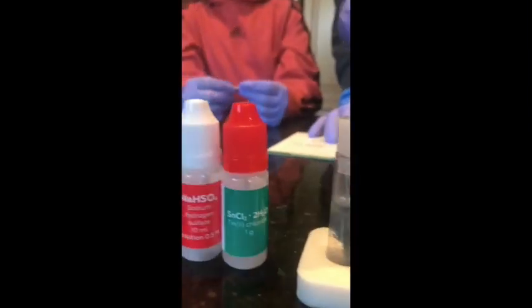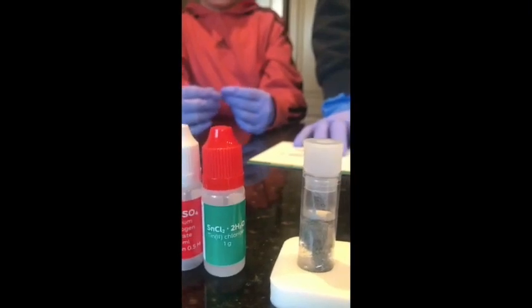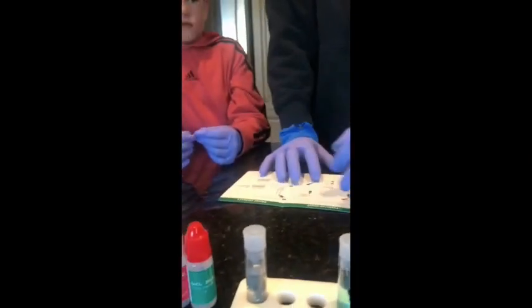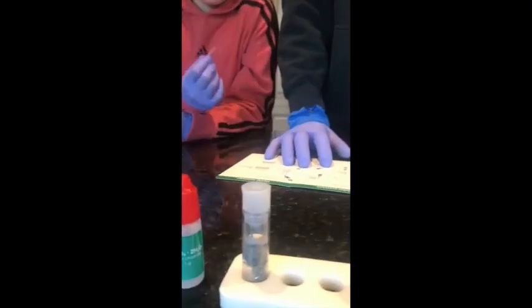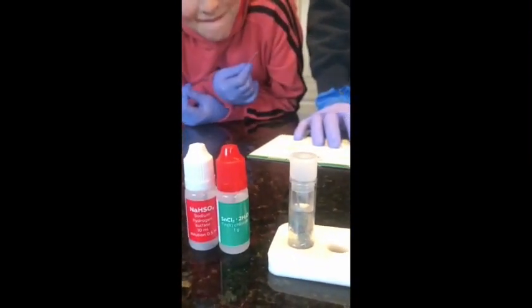And the second one we have, I just got to read them, I'm sorry, tin 2 chloride and sodium hydrogen sulfate mixed together, and we have a piece of magnesium in both containers. Sorry, zinc, pieces of zinc, inside of our test tubes, and we've let them sit for 15 minutes, and we're going to check the results.